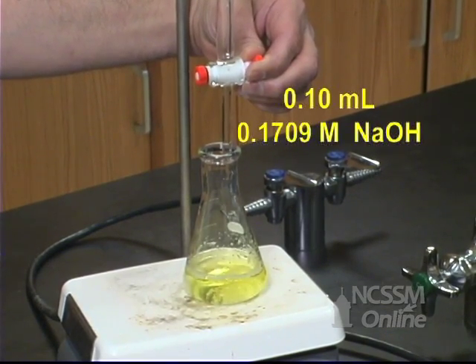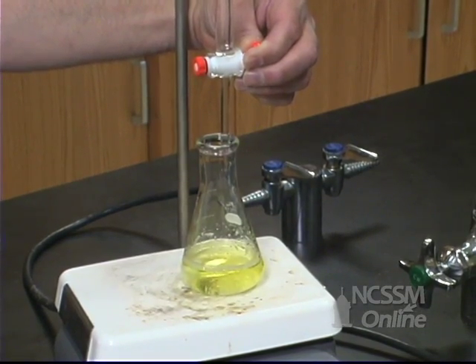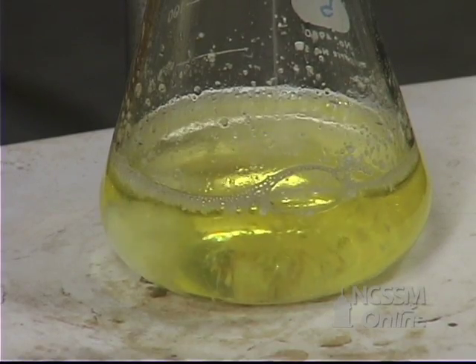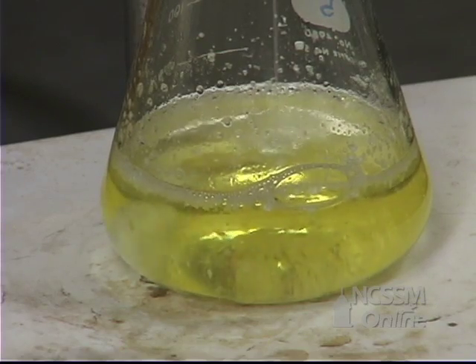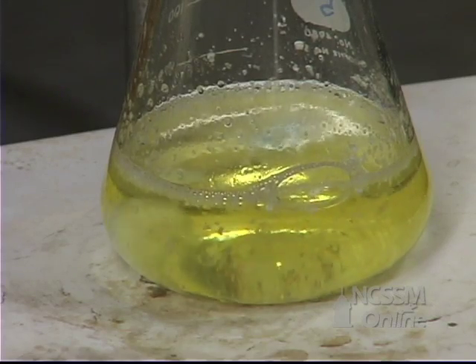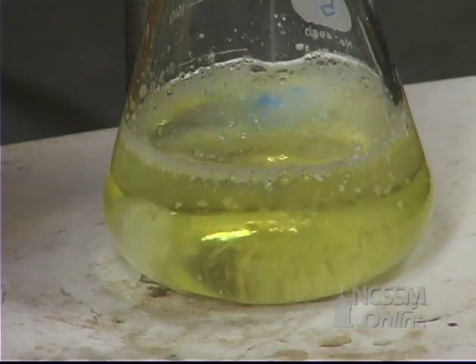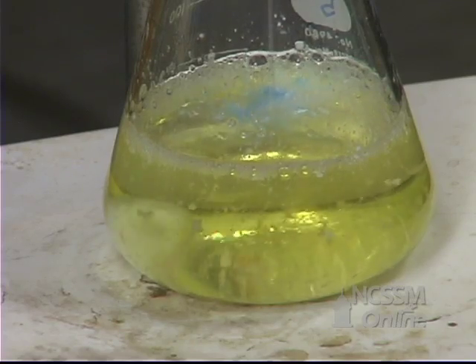We've taken an initial burette reading. We're going to slowly add the sodium hydroxide solution until the reaction mixture turns blue. At that point, we'll have the same number of moles of sodium hydroxide added as moles of excess HCl in the reaction mixture. We'll rinse down the flask periodically to make sure that all the reaction mixture has a chance to react.